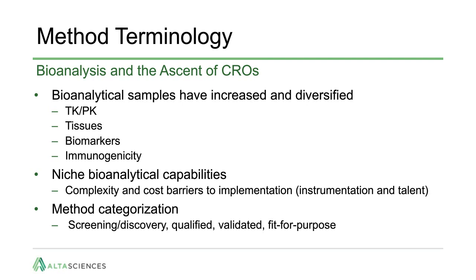With the ascent of the CROs as partners in development, method categorization, such as screening, discovery, qualified, validated, fit for purpose, is now in discussion. When bioanalysis was conducted at the innovator company, any limitations or gaps were managed as the program progressed. And in my opinion, such precision in method status was probably not needed for every study. The method should provide meaningful and scientifically relevant data for decision-making.